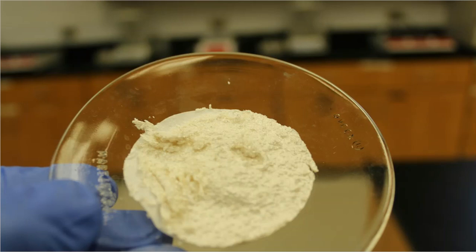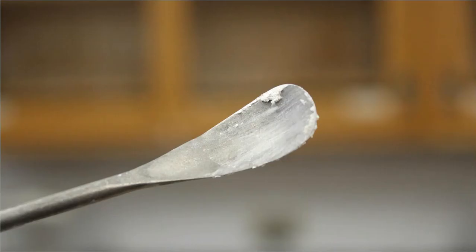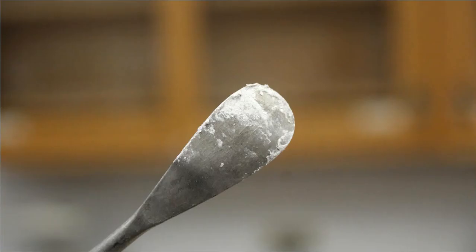to dry it. Now the problem is that I have some left behind. The scoop that I used to scoop out that stuff in the Buchner funnel, this product was really sticky, and it started to stick to the scoops and to the tools that I began to use in the lab. So here's a picture of that image, and then on the back side of the scoop, I see even more. All right, so there's going to be some product that has been lost that I'm not going to be able to recover. But I've at least made a note of it.